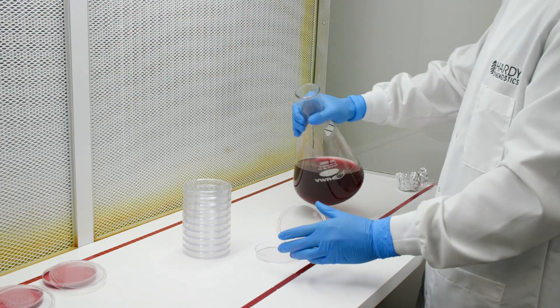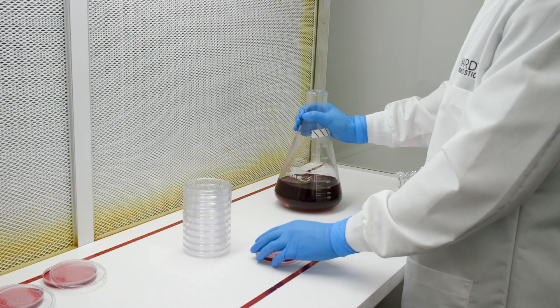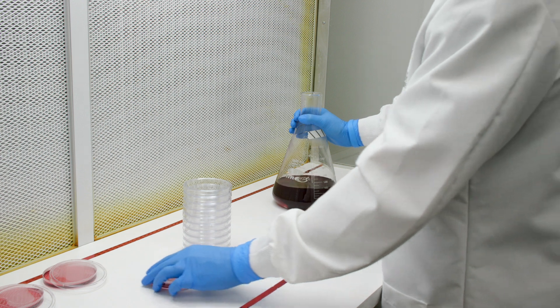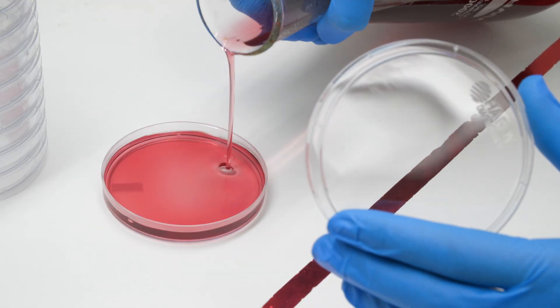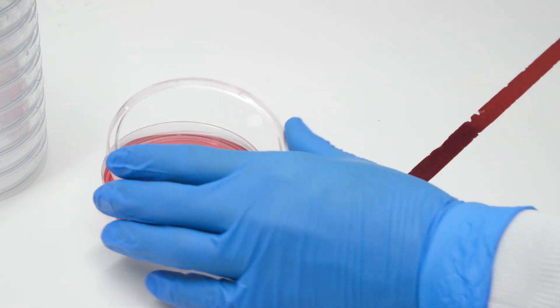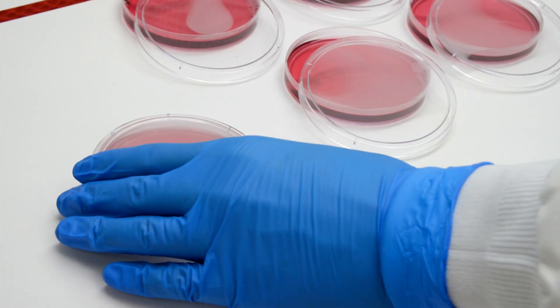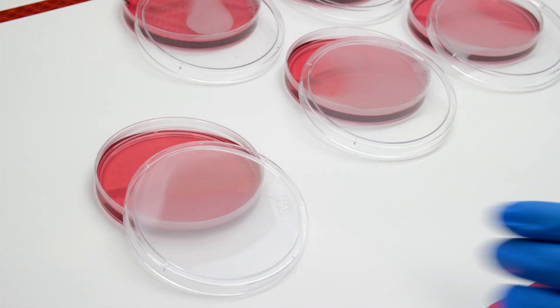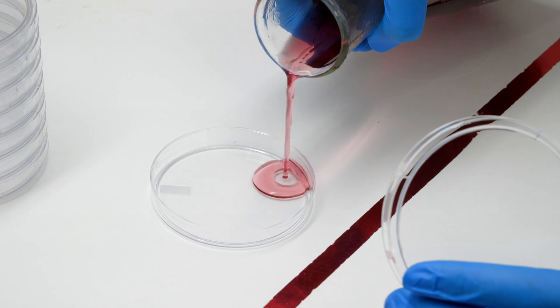Aseptically dispense approximately 20 ml of media into sterile petri plates. Ideally, do this in front of a HEPA filter clean bench. If one is not available, do the pouring in a room with minimal air currents in order to avoid contamination. If excessive condensation is a problem, cock the lids to the side to allow the water vapor to escape. Be sure to pour slowly so as not to create bubbles.